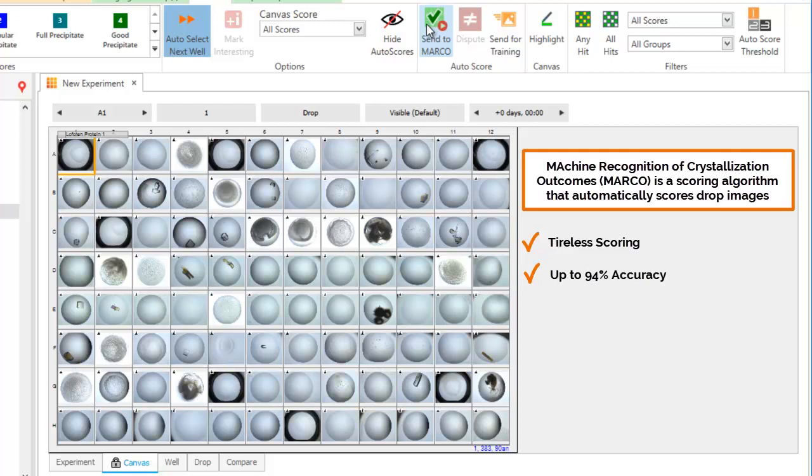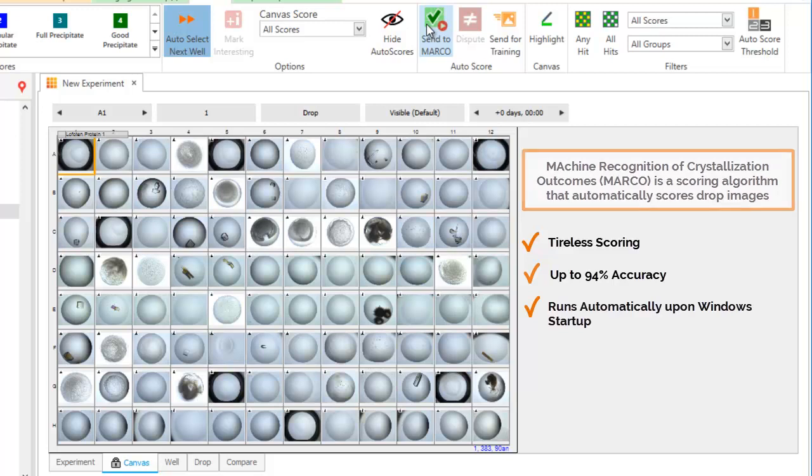Even better, your drop images are scored automatically the moment they are imported back into Rockmaker after being imaged in Rockimager. Rockmaker with Marco removes the tedium and guesswork that comes from manually scoring drop images so that you can focus on moving your research forward.